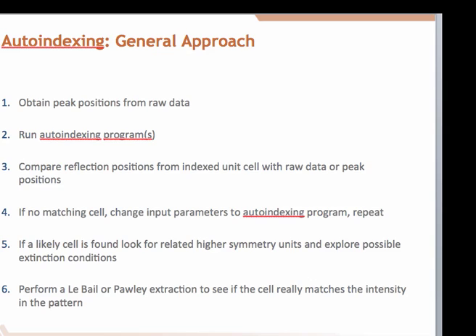And these ice crystals, since you're seeing the diffraction from a single grain of ice, can be much sharper than the powder diffraction data. Likewise, peaks that are very broad also could be impurities, or could be more than one reflection that's superimposed, in which case you can potentially confuse the auto-indexing, because it's going to be looking for 2 peaks at different positions from the composite, from the overlap of the 2 peaks.